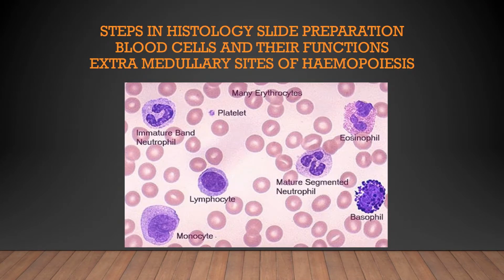So this is the slide of a peripheral blood smear. It's more common in physiology than it is in histology. In terms of the steps in histology slide preparation, you're going to have fixation, which involves prevention.